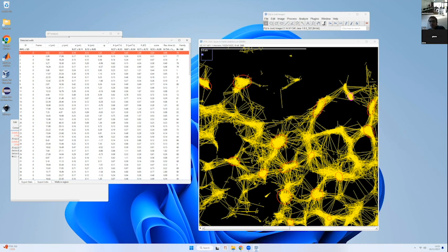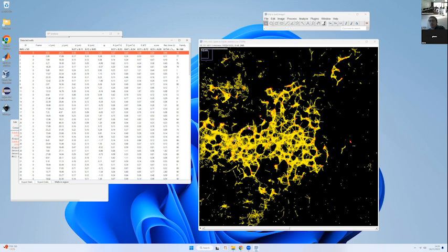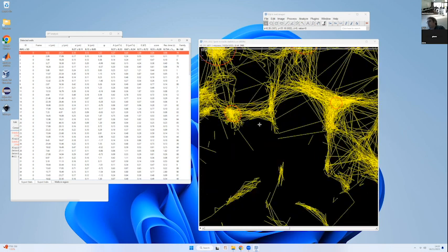Okay, I think we are good. So if you want, you can also show just the trajectories in one color. Then you have the potential value. Then you can see if you're happy or not happy. Then we can change the parameters. But that's basically how it works.